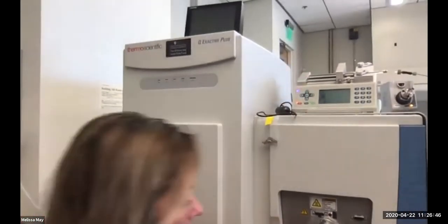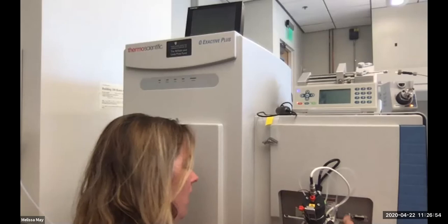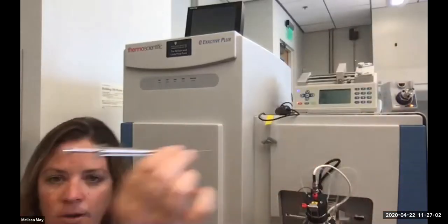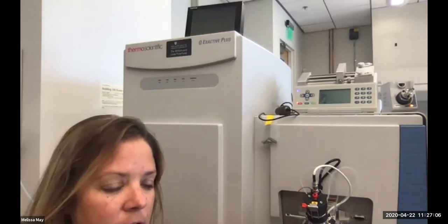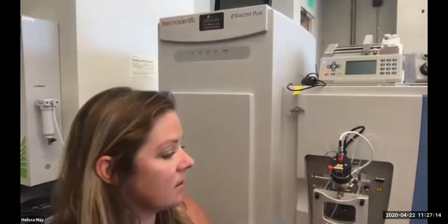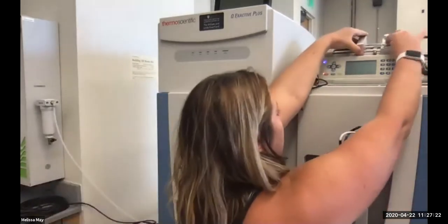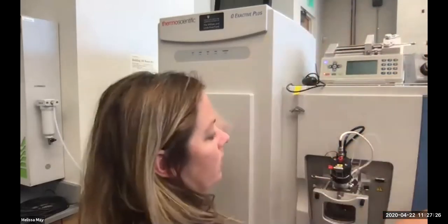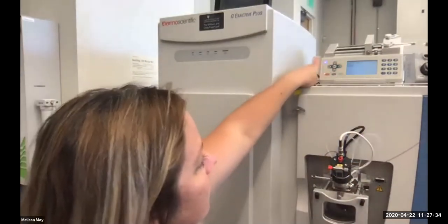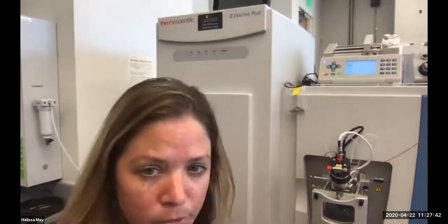Up here, like I said, this is our syringe pump. For the most part, we use it when we are calibrating. As I mentioned before, we have a Hamilton syringe, a 500 microliter syringe that we got with the instrument. We load sample into this, typically Calmix, and then hook it up through these PEEK fittings and put it into the syringe pump. There's another PEEK fitting that connects in here. So we put the syringe online. You can either manually control it here, so I can turn the syringe on, which will start pushing sample through at whatever rate I've specified, or you can also control that through tune.